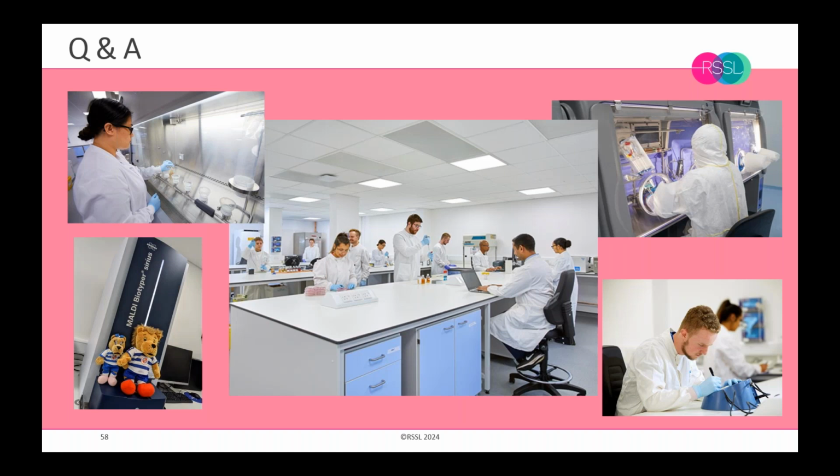So everything's going to vary a little bit according to the facility and the type of environmental monitoring, and it's always recommended that you run a study. However, in theory, a lower incubation is preferable, because some fungi are very sensitive to a higher incubation first.